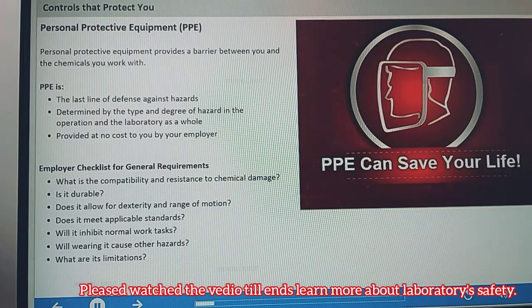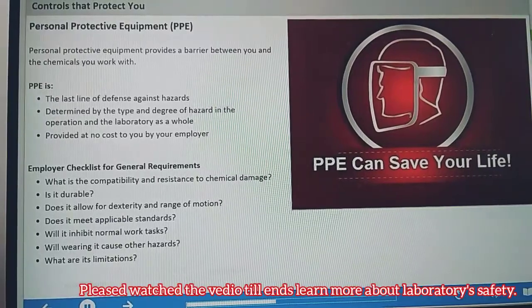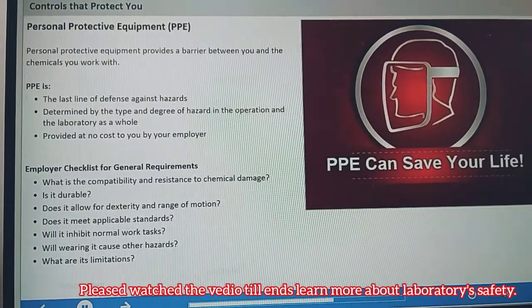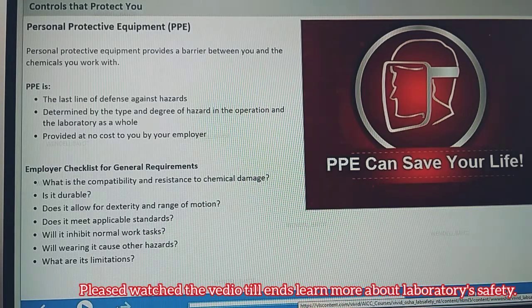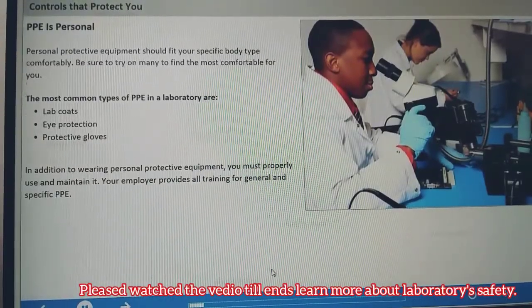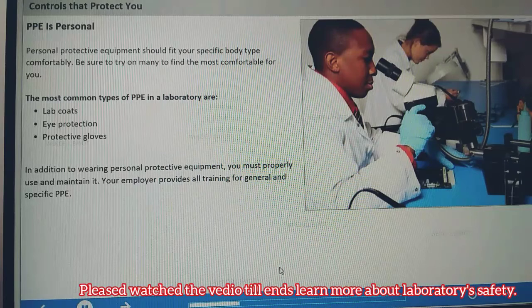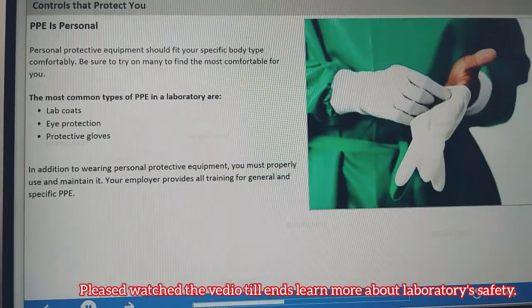Personal protective equipment, commonly referred to as PPE, provides a barrier between you and the chemicals you work with. In the hierarchy of controls, PPE is implemented last after administrative and engineering controls. While it is the least preferred method, it is just as important as the last line of defense against hazards. The specific type of PPE you wear is determined and provided by your employer based on the type and degree of hazard in both the specific operation you are conducting and the laboratory as a whole. The most common types of PPE in laboratories are eye protection, a lab coat, and protective gloves.